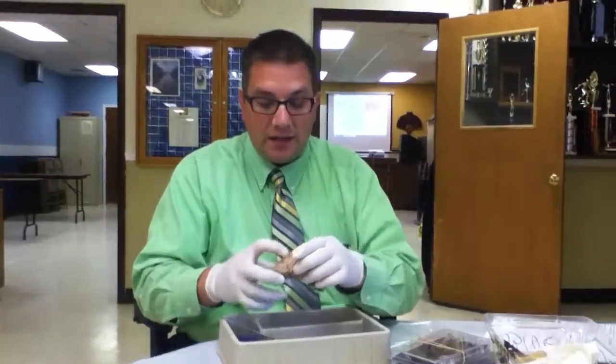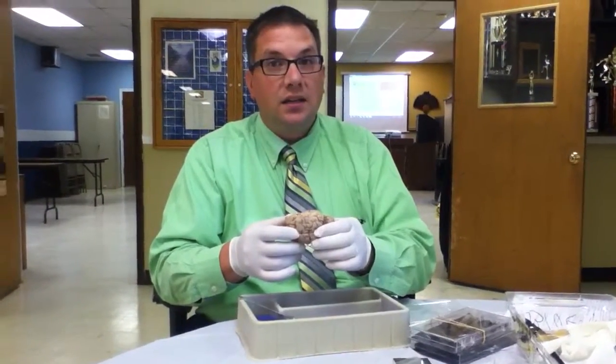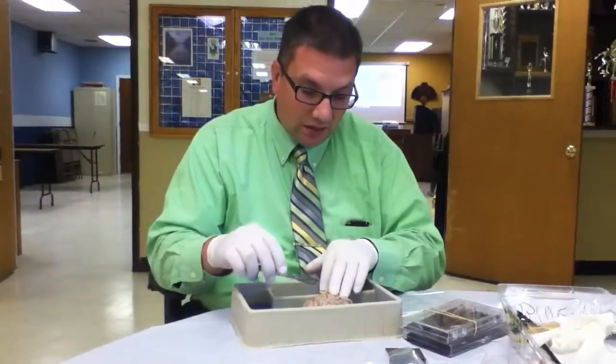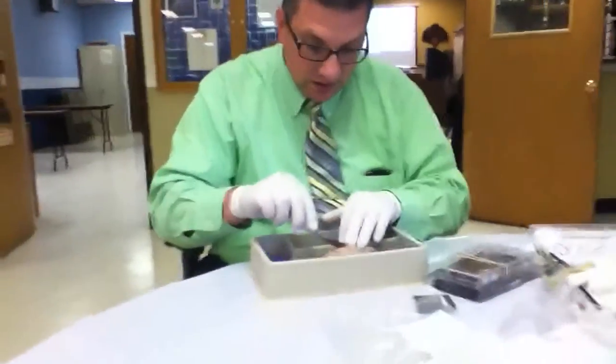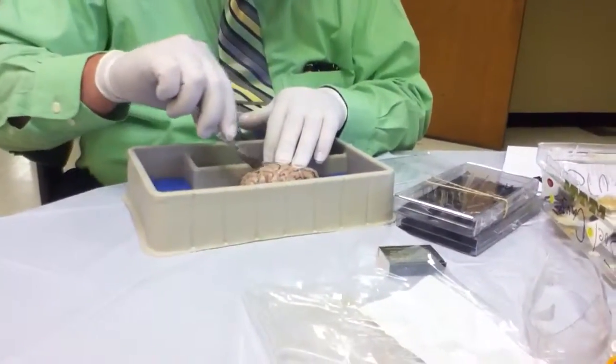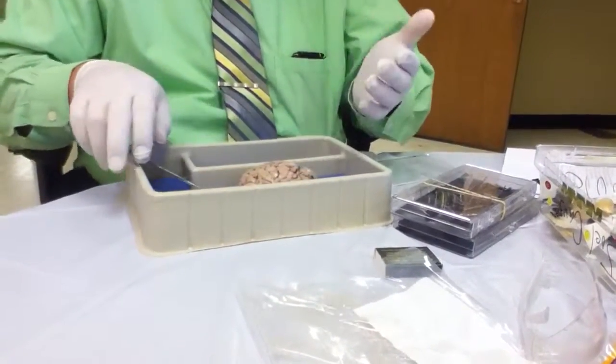So the brain is not going to be this color. What makes it this color? Oxygen? It is the meninges. Meninges — that is this color. Remember the guy on the video cut through that? This one doesn't seem to have the meninges on it.